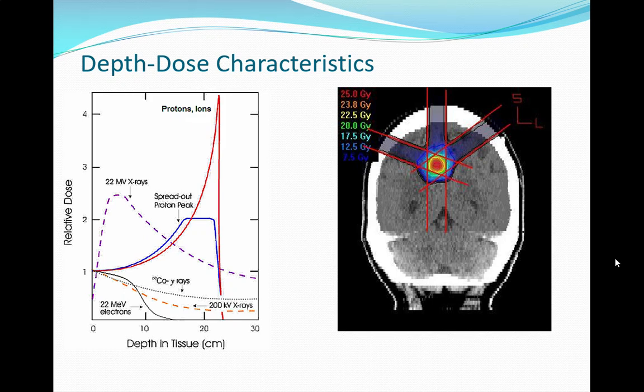Well, when you deal with an awful lot of particles, you'll see this kind of standard drop-off that goes on here, right? And it'll vary. When you've got low energy X-rays, here they've got 200 kV, you can see it does this standard drop-off, which you'd expect, exponential decay.